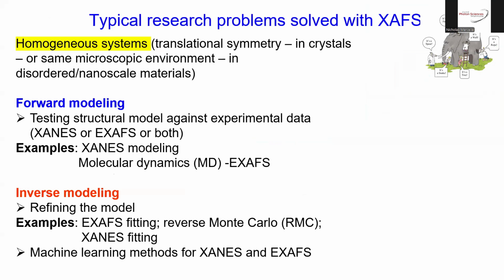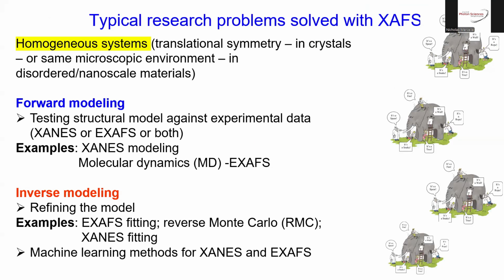So this is a case where you may have good reproducibility between one atom environment and the other. Like if you think of each atom having various details of the local geometry, but all atoms are equivalent in that sense. You can still use an average technique to understand all those details, right? Because you probe all of them and they give an identical signal. You can average it out and you will get a representative species that you can understand. Like this is an example of a blind man touching an elephant, but in our case, we are not that blind. For us, the most important thing is that these all are identical species, and we can understand them using this advanced analysis that you will learn in this series of workshops.